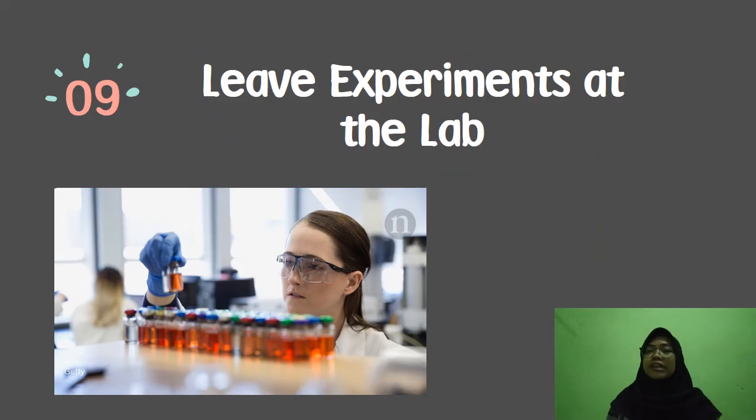It's important for your safety and the safety of others to leave your experiment at the lab. Don't take it home with you. You could have a spill or lose a specimen or have an accident.